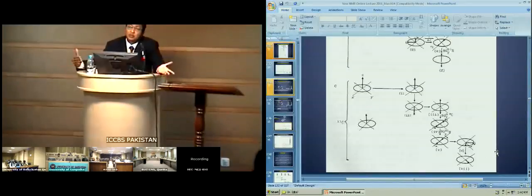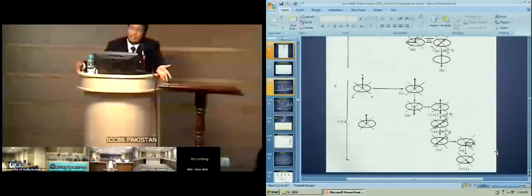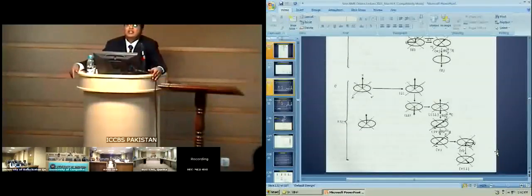So this Boltzmann distribution axis of the proton is added to the Boltzmann distribution axis of the carbon, a situation in which you have a plus and minus carbon. And in order to detect, you need a Y pulse to bring it to the XY plane, because you cannot see it unless it becomes an XY plane.